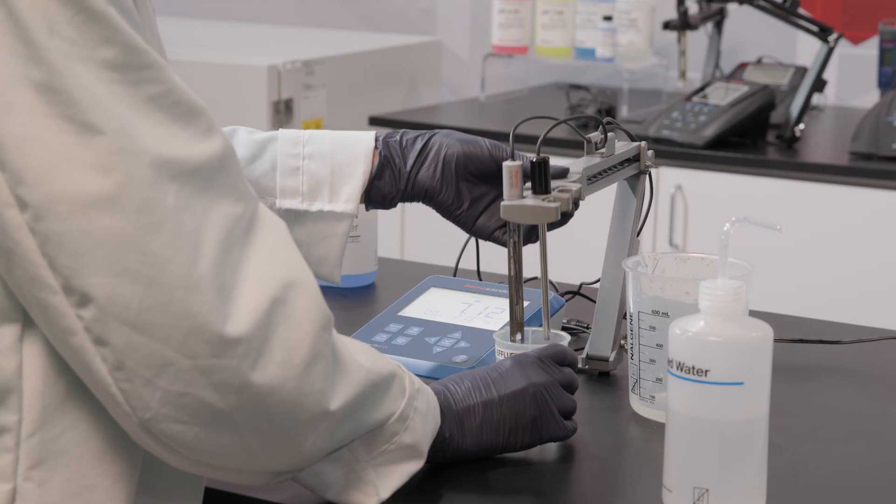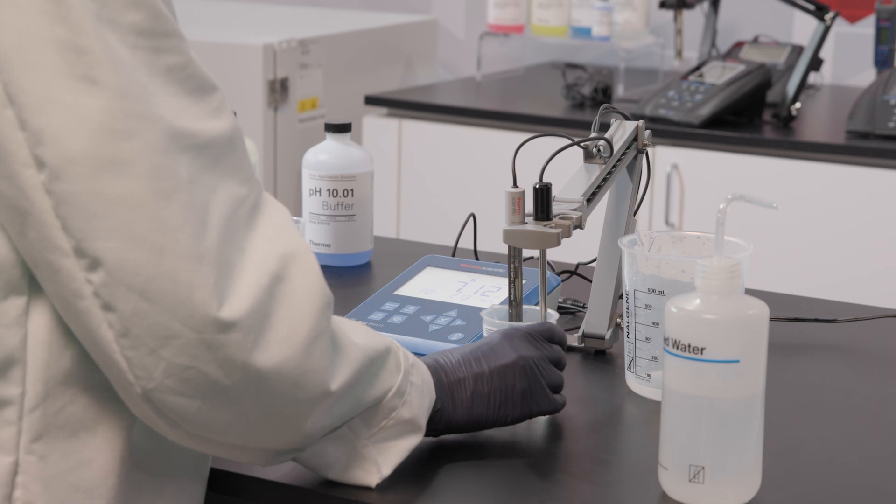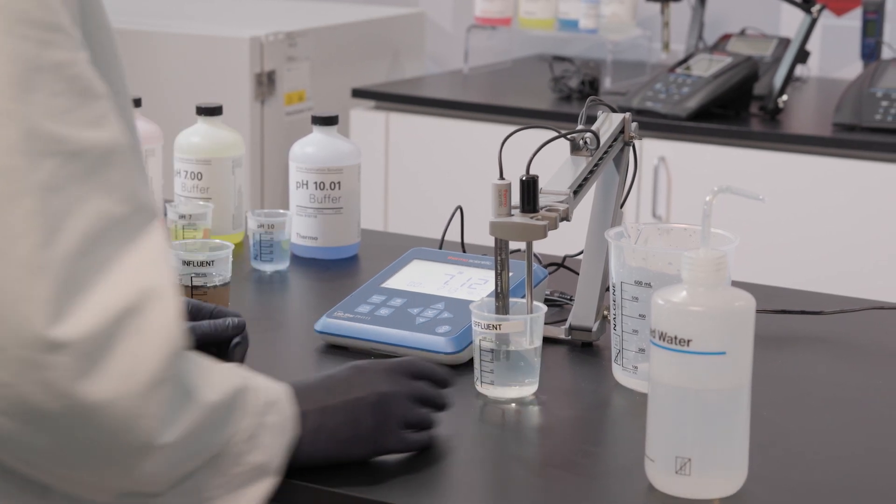As you tackle common laboratory tasks, including measuring pH, it's important to choose the right equipment. Although pH testing seems simple, it can be complex and not always easy to understand or get right.